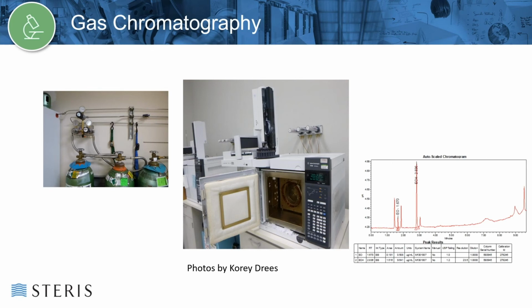We analyze ethylene oxide residues through gas chromatography. Gas chromatography involves an inert, unreactive gas such as helium, shown in the gas cylinder on the left, which acts as a mobile phase to move chemicals through the column, the circular item in the column oven. The mobile phase goes through traps which filter out water and hydrocarbons from contaminating the column.